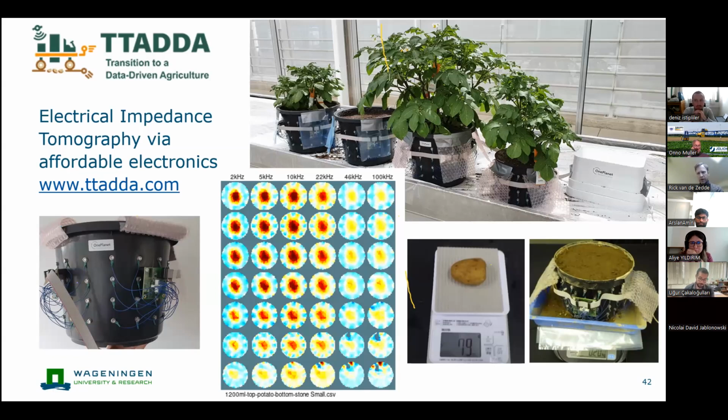And we have been trying to go towards fields with this root phenotyping challenge. We designed a very fancy and simple plot. This is the bucket sensor, as we call it within our group. This is cheap and it is scalable.